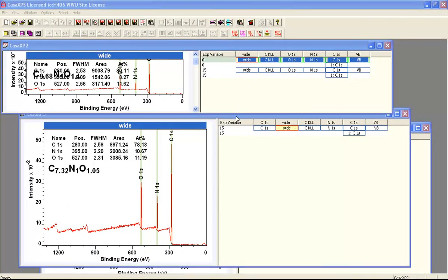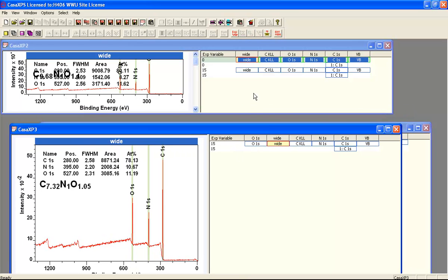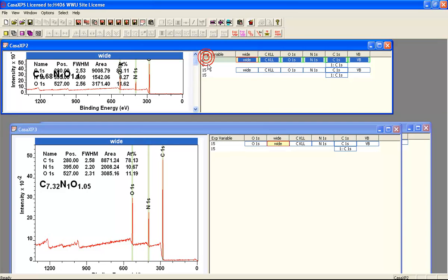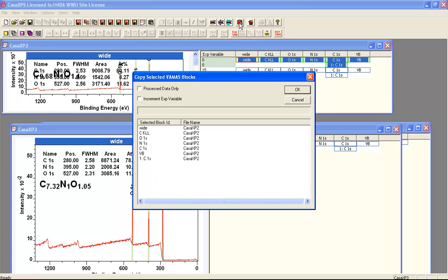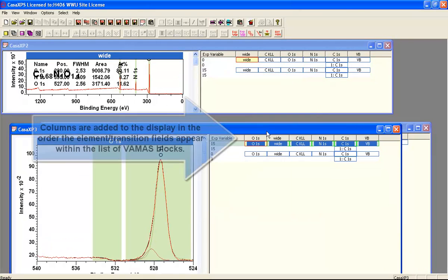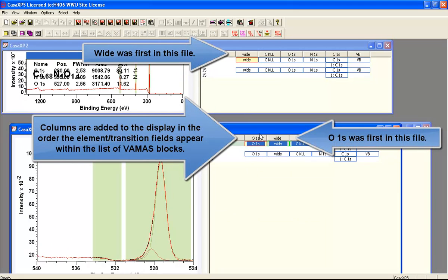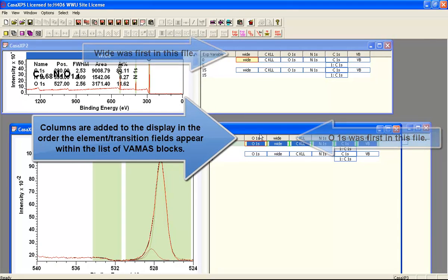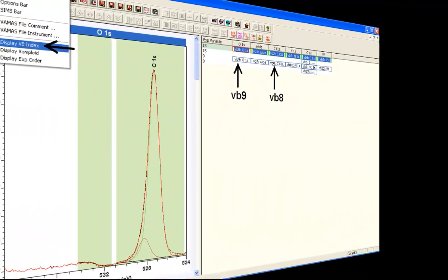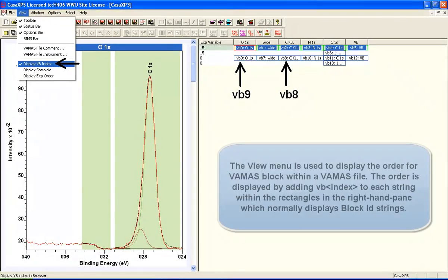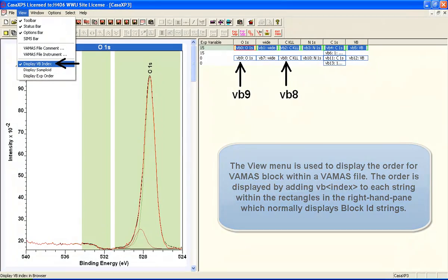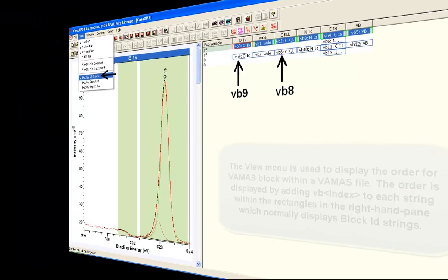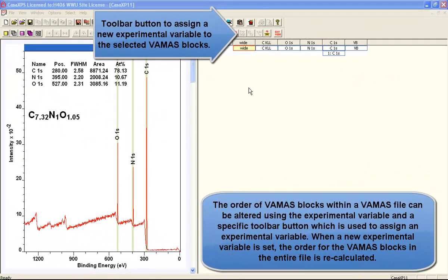You can see the importance of the element transition field because of the order with which you copy these. If I've copied from one file to another where the wide spectrum appeared first, then it will appear in the first column. If I do the same operation in reverse where I've got the Oxygen1S as the first VAMAS block, then the file will appear with the Oxygen1S as the first column.